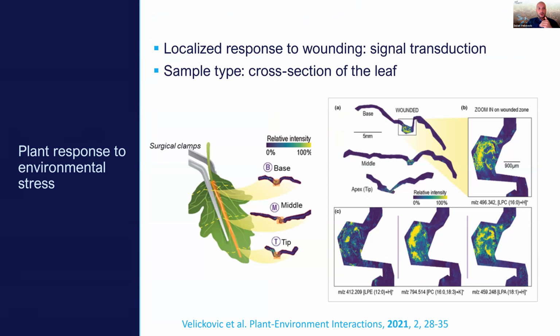Then we can also analyze how a plant responds to environmental stress, especially the localized response. In this case, for example, mechanical wounding of the leaf.